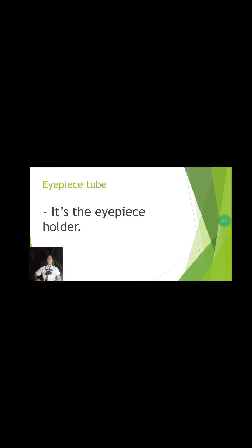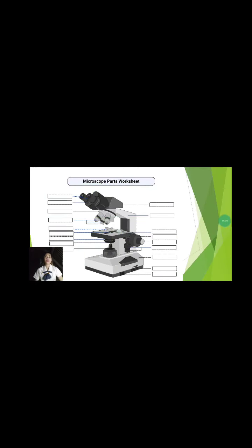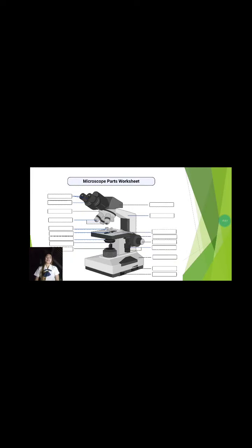So, karon na ako'y ipabuhat ninyo. I have here a microscope worksheet. So, unsa inyong buhaton is, ipabutang ninyo ang mga parts. Only the parts, ayaw apila ang functions. So, nakakuha? Mga bright jud kay nakakuha. So, let's proceed.